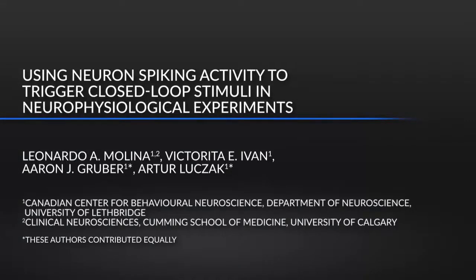This standard neurophysiological recording system can be used to perform a closed-loop stimulation, which is useful for studying causal interactions in the brain. This protocol allows neuroscientists with only limited expertise in computer science to rapidly implement a variety of closed-loop experiments with little cost.